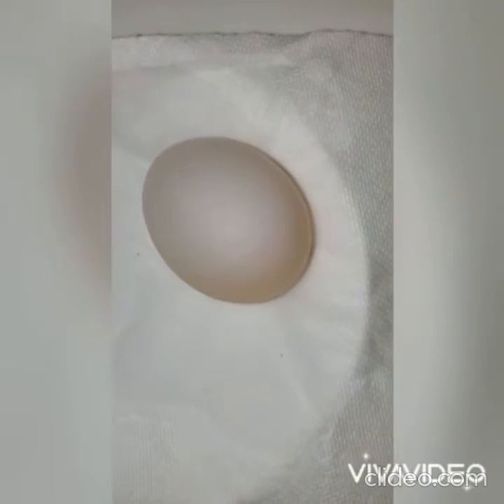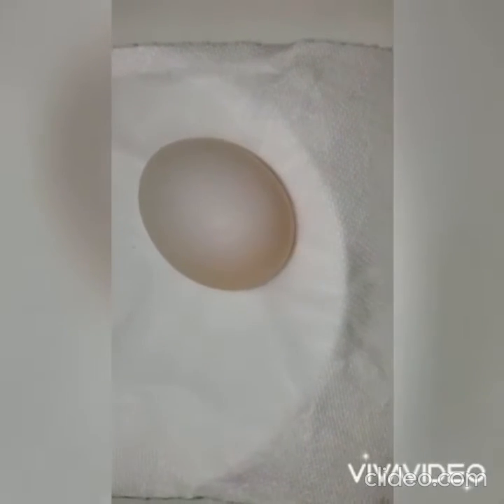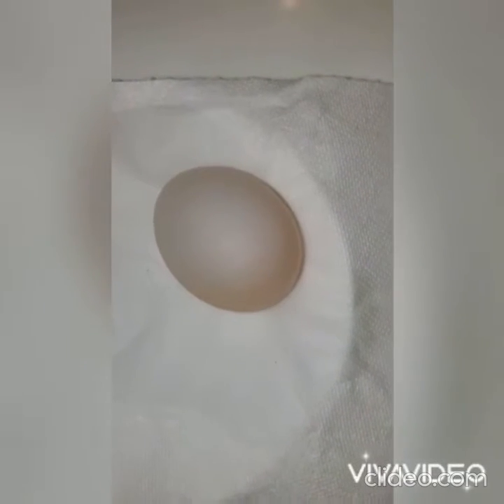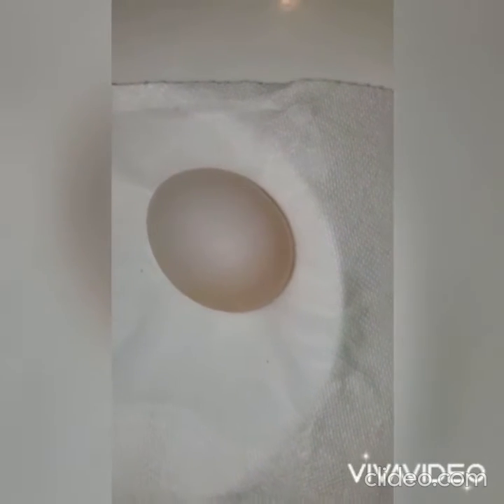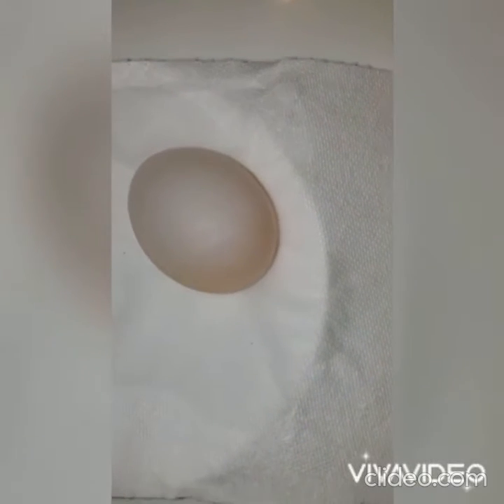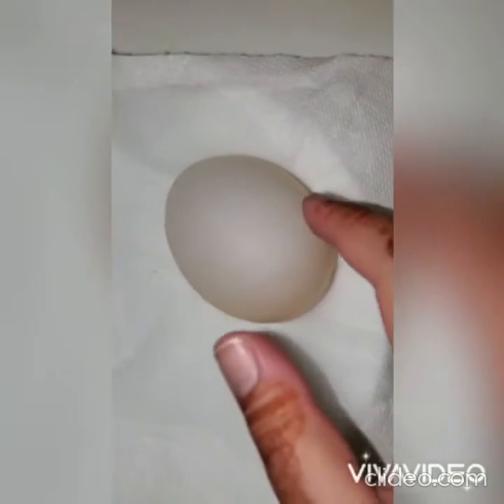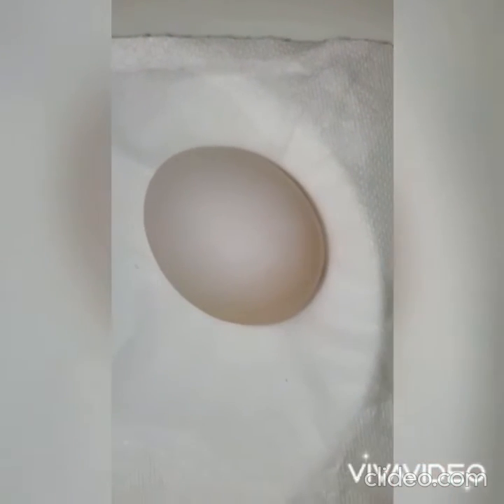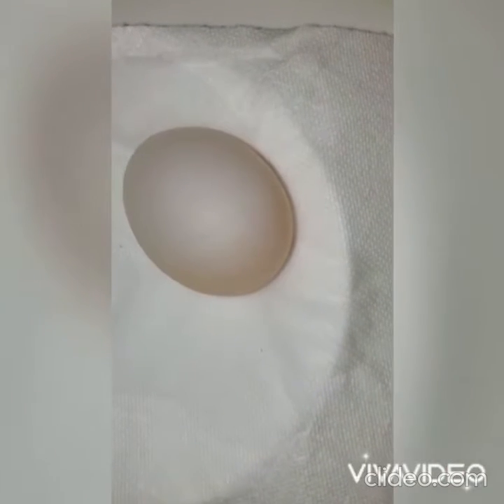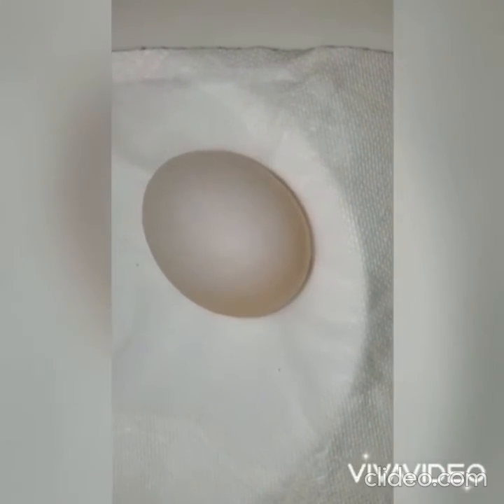This change in the size of the egg took place because of osmosis. So, in osmosis, water moves from a region of high to low water potential down the concentration gradient through a semi-permeable membrane until equilibrium is reached. We can hypothesize that this membrane surrounding the egg acts like a semi-permeable membrane, so it lets certain small molecules such as water cross the membrane, whereas other big molecules cannot cross the membrane.